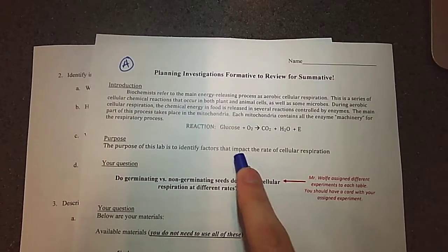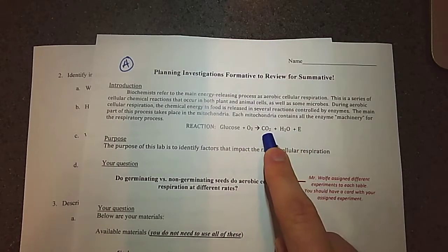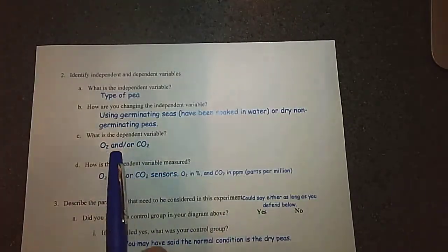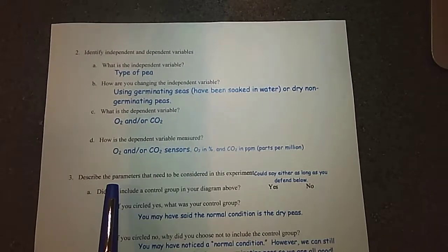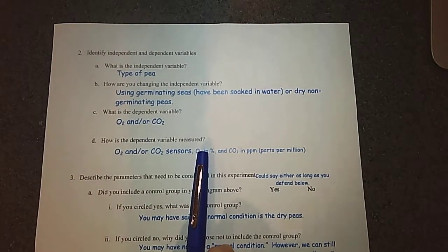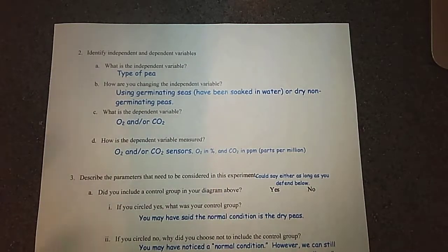So I could either measure the reactants, or I can measure the products. And luckily we have the CO2 sensor and the O2 sensor. So my dependent variable is either going to be the amount of oxygen or CO2. So specifically, how am I measuring that? With the oxygen or CO2 sensors. All right, and it's important to also include units as well. So for oxygen, it's going to be the percentage of oxygen, and CO2, it's going to be in parts per million. So with that in mind, let's actually look at the experimental setup that I drew here for that.